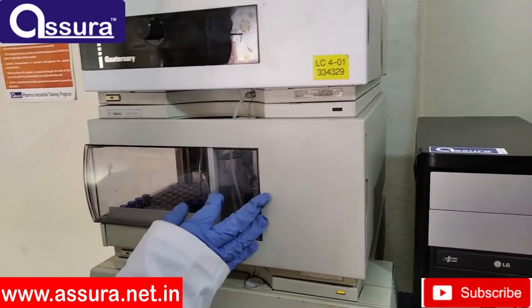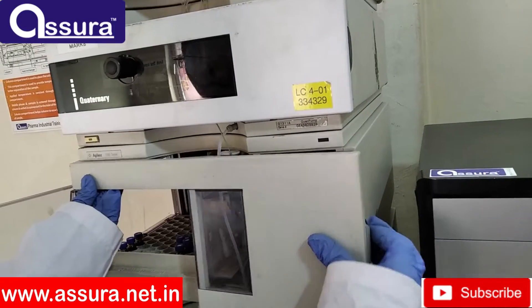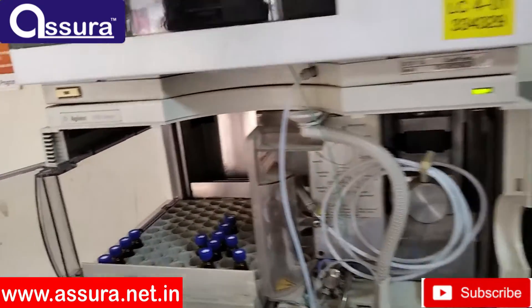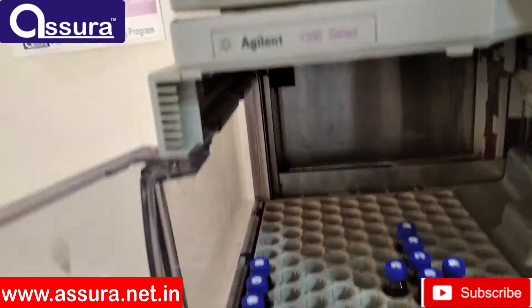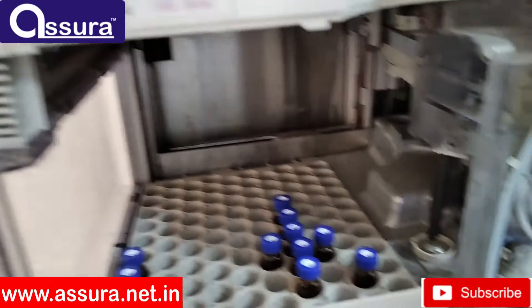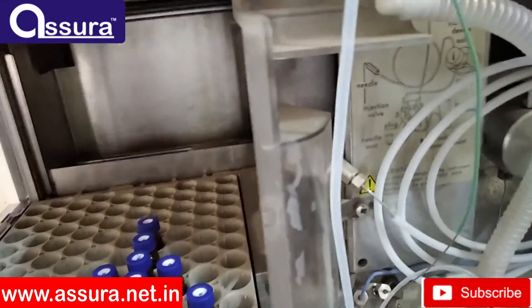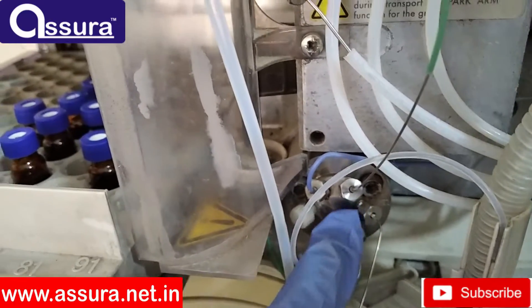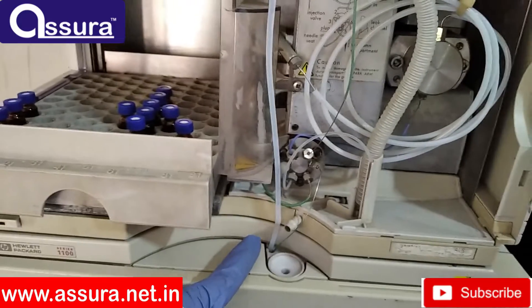The next one is the auto injector. The injector's main work is to pick up the sample through the vial and inject the sample into the injector. A 100-vial capacity tray is suitable and is placed in the injector. As per a given sequence, the injector injects vials one by one into the system. There is a six-port valve which flows the sample through the mobile phase. One port from the six-port valve continues through the mobile phase with constant flow. This sample is mixed with mobile phase and reaches the column inlet.